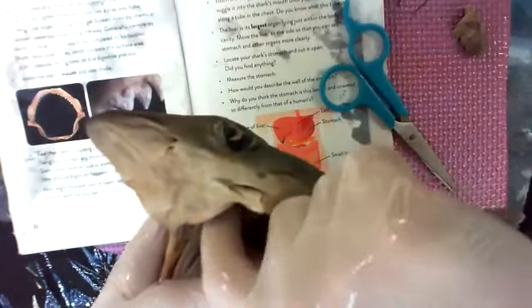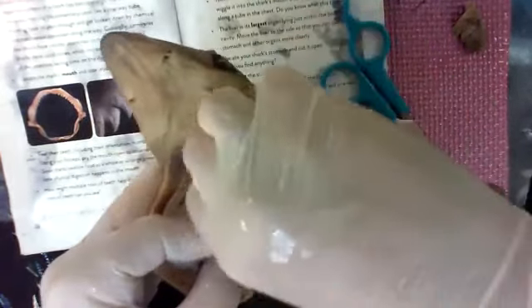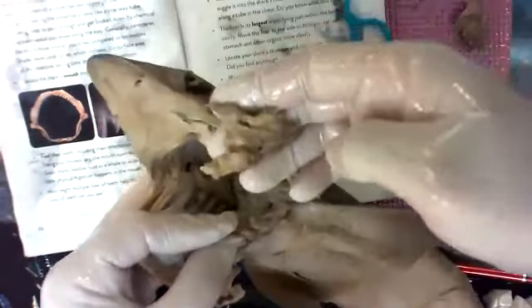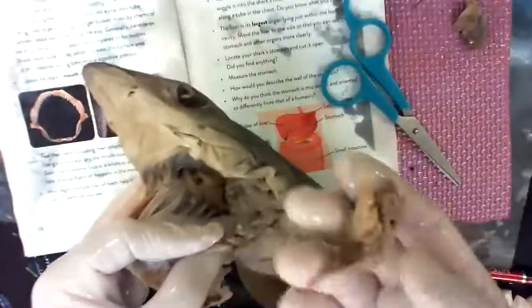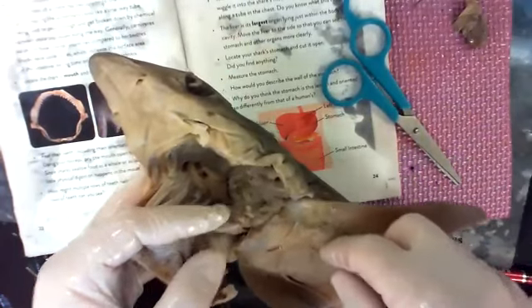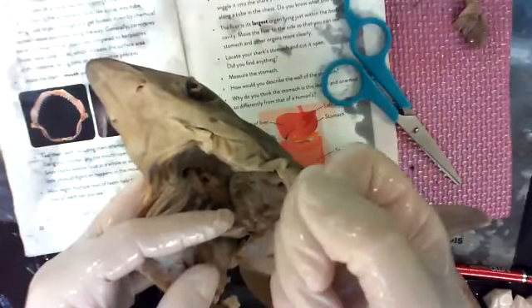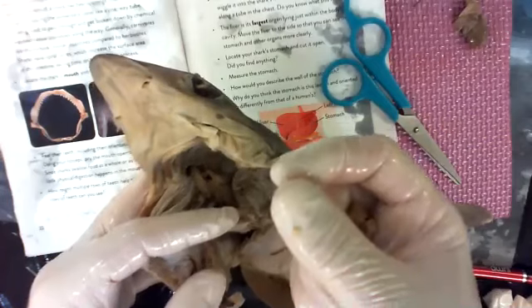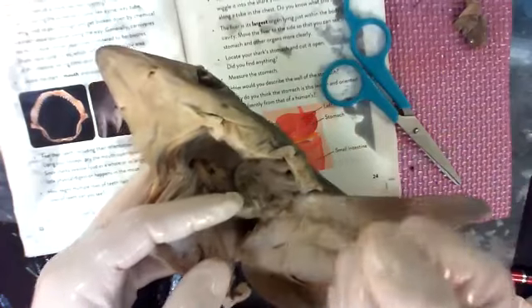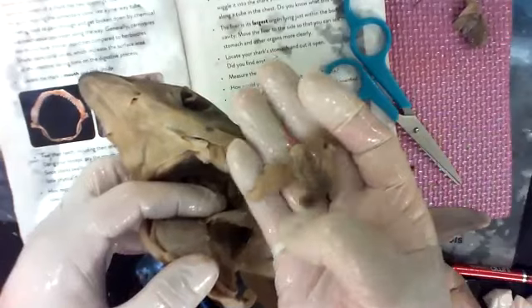This is all gunk that we can get rid of. This is all part of the last meal. I don't know if you can see all that. Just taking my fingers in, pulling it out. Ugh. So this is what should happen to food. It eats the food. It goes down and into the stomach. And then the stomach's job is to smash and grind. Like when you eat an apple, you take a chunk, you bite into little chunks, chew it into littler chunks, you swallow it. It's not done yet. When it gets in your stomach, then your stomach has to grind it and turn it into applesauce. Not even the grainy applesauce. It has to turn into something that's like baby food, like this.